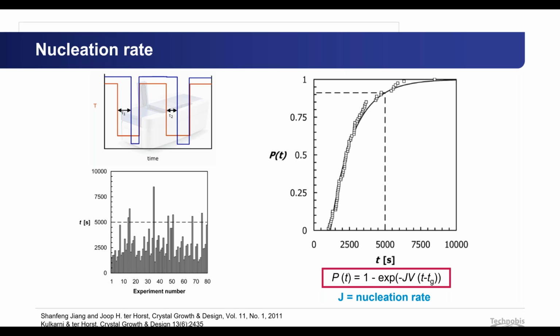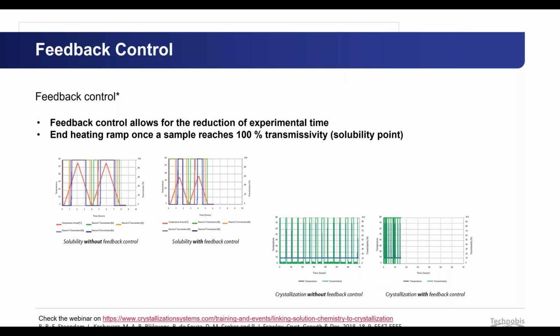A group of Dr. Horst, then the one of Marco Mazzotti, and Thomas Vetter. I remember he also had quite a few publications where on the Crystal16 a method was defined on how to perform these induction time measurements in an optimal way. Again, if you would like to find more about it, I can share more in an email afterwards.